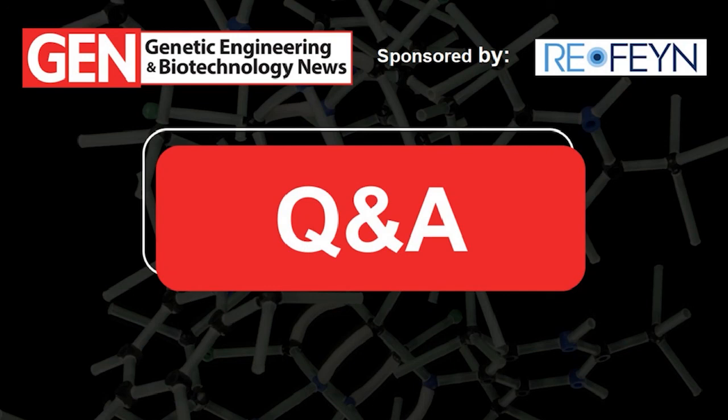All right, thank you for that. And it looks like we have time for one last question here, which I think is pretty good. Santosh would like to know, how often do you need to change the glass stage? That's a good point. We can only measure once at a certain spot on the glass slide, because the molecules would bind to the surface, and then we have to move to a different spot.